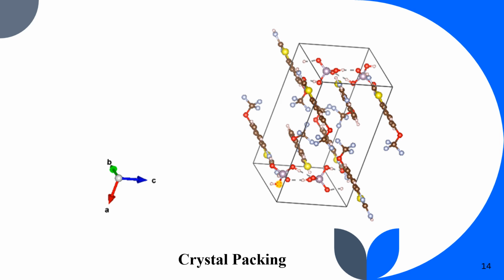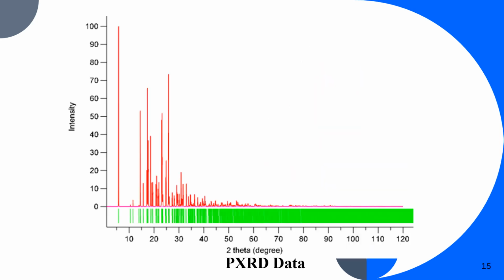There is symmetry in the arrangement of the crystal, diagonally also, and just by rotating it we can view different angles and see there is some pattern followed by the crystal arrangement, which gives a very broad picture of the crystal packing.